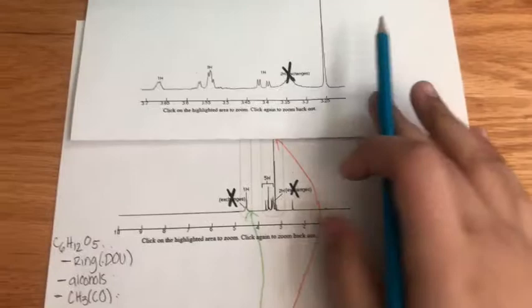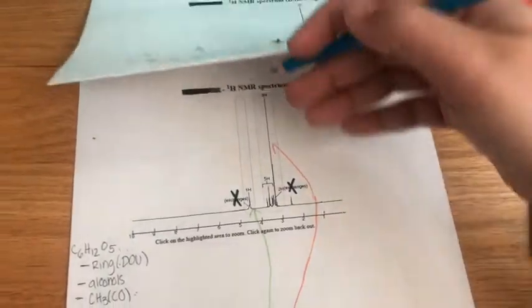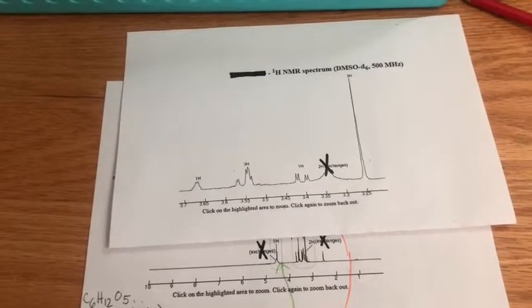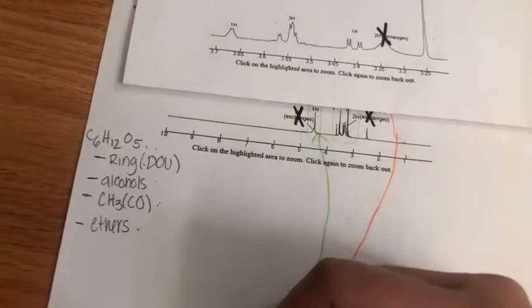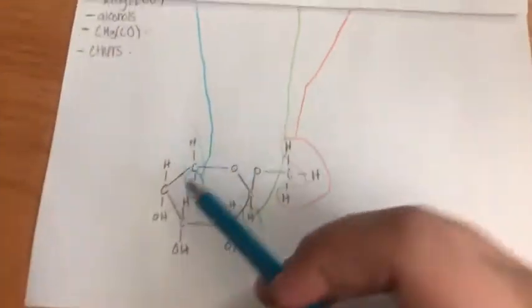I'm going to have to take a closer look at this zoom in version that includes that 3H peak that was representative of the CH3, and these 5H's here, which as you can see is split up into a 1H reading, a 3H reading, and another 1H reading. So one of those 1H readings, which is representative of this one right here, is going to be the one that is furthest downfield, which we're just going to overlap this right here. That 1H reading is representative of that hydrogen.